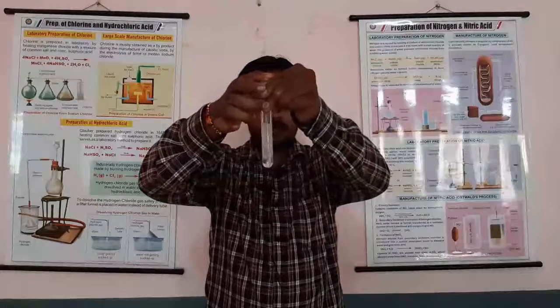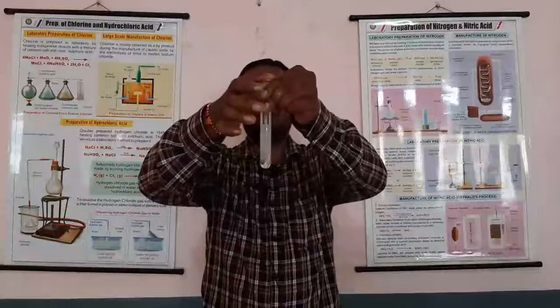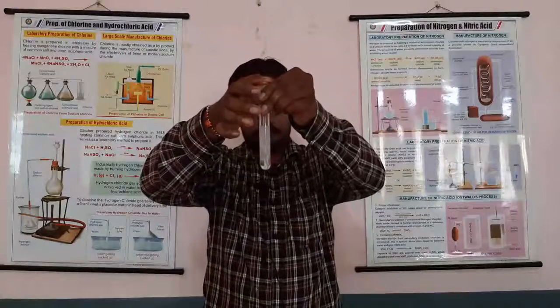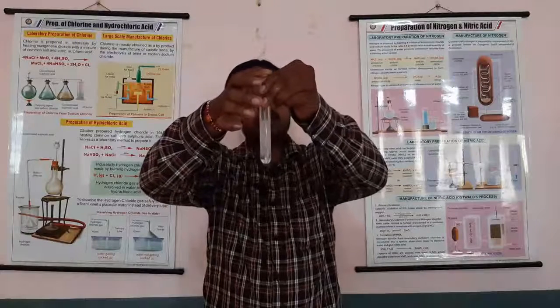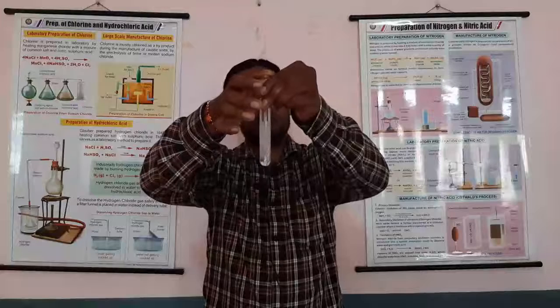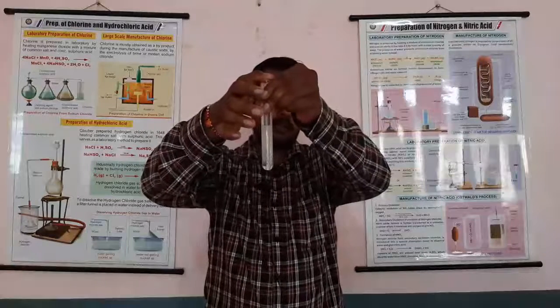I am stopping the release of hydrogen gas by closing the mouth of the test tube. You can see the zinc is reacting very fast with the hydrochloric acid solution.